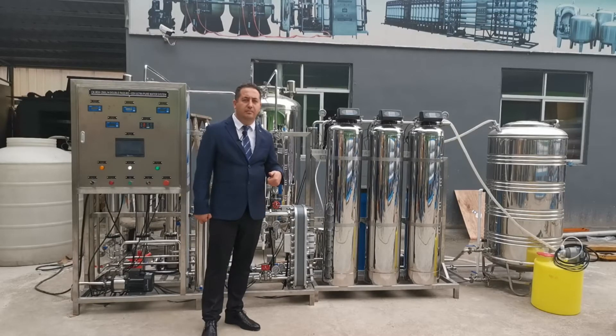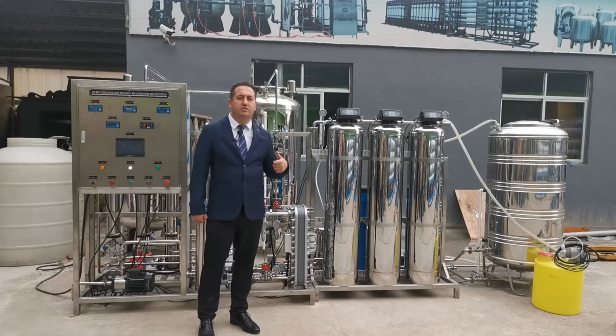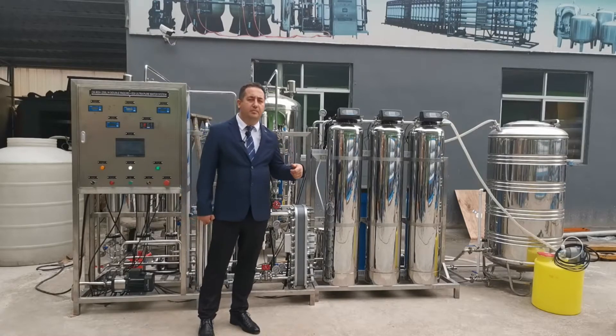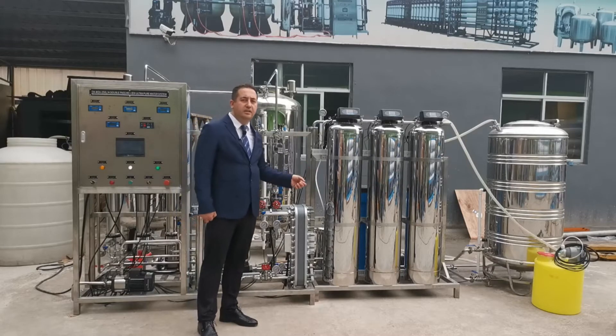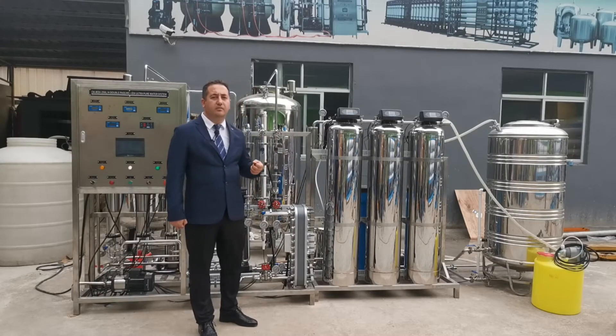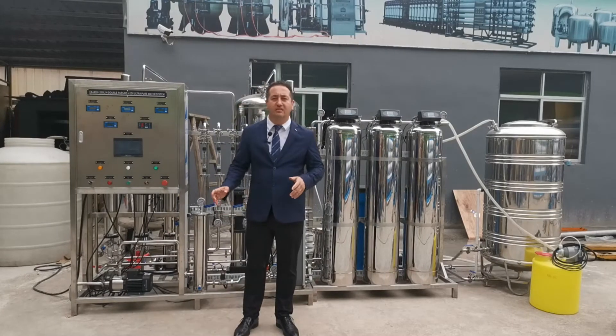After the third membrane we send the water to a storage tank. After this storage tank the water is pumped again to our EDI membrane. After the EDI membrane we send the water to a second tank.